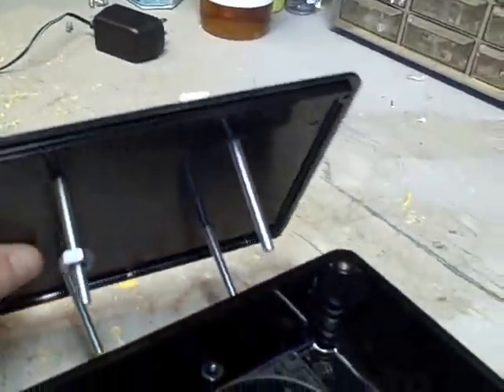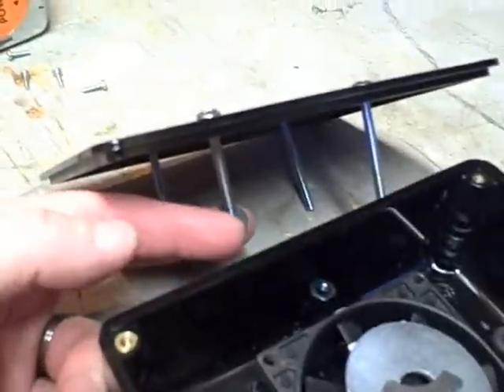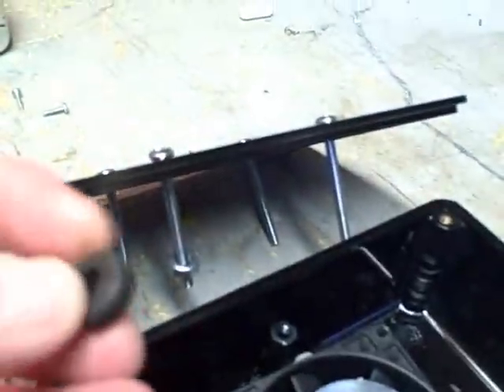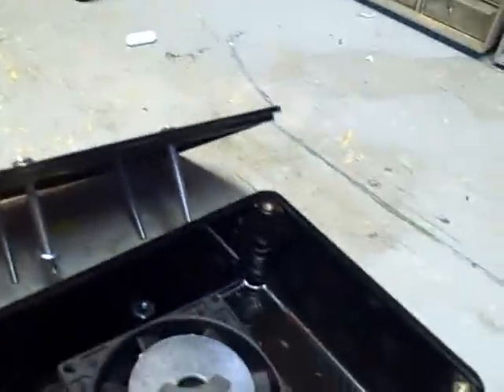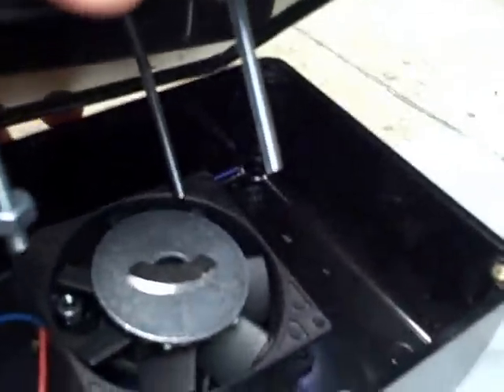I've got four long screws — the ones I brought home weren't long enough, but I had some at work. For spacers, I've got a nut on there that's too big that I just slid up on there, and on each bolt I use a rubber grommet. All four of those go around the edges and then the fan mounts to that. I drilled out the corner holes on the fan just a little bit. I'm leaving about three-eighths of an inch between the edge of the fan and the bottom of the lid.